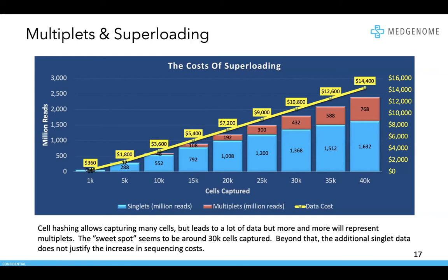As for the Cellplex, the new kit from 10x Genomics, I'll add a few slides to this just for reference, but it would take a while to go through, and so maybe that could be for a later training. But if there are any questions specifically about this, maybe I should share my screen again in case I need to reference a slide. Feel free to ask questions.